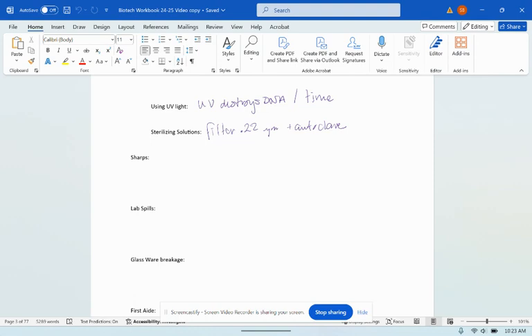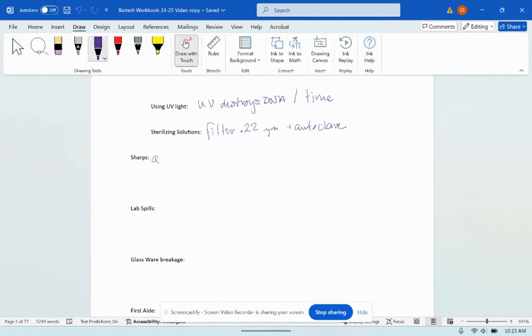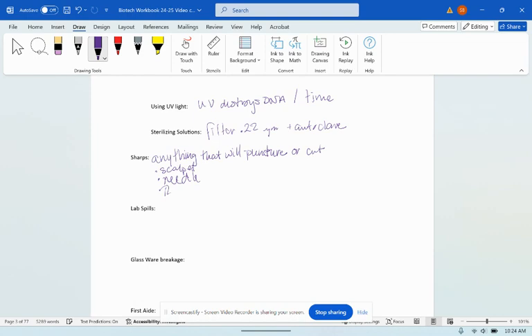So sharps are anything that will puncture or cut. There's a C in there. So we are thinking anything like a scalpel, like scissors or a knife. We don't really use scissors or knives in labs all that much. Sometimes we will think of like a needle. So anytime that we are doing things with a syringe that has a needle in it, syringes, sometimes we will use razor blades. We will use razor blades in the lab sometimes to make very precise cuts, okay?